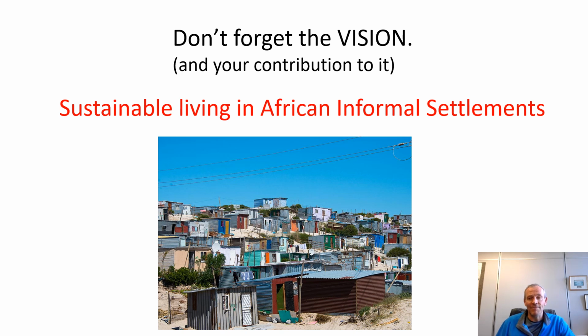So that decision has been made, but now a lot of development work needs to be performed, and the work that you are doing is contributing to our understanding and our development towards implementing this project. So always keep this in mind. Your bag might be 10 liters, but at the back of your head, you're thinking an 800-liter bag somewhere in a trench outside where a similar process is occurring.